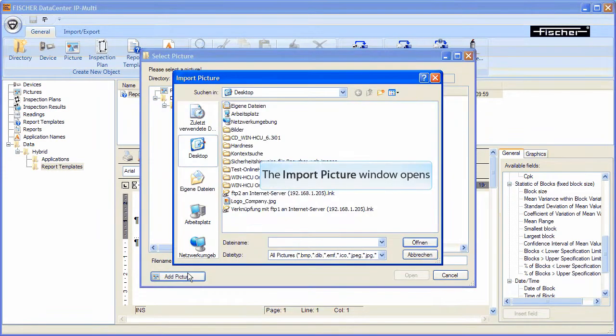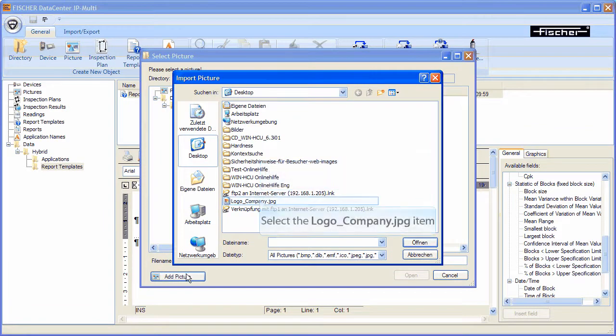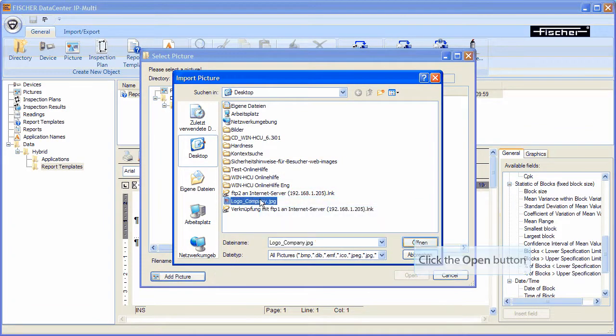The window import picture appears. Now select the company logo and click the open button.